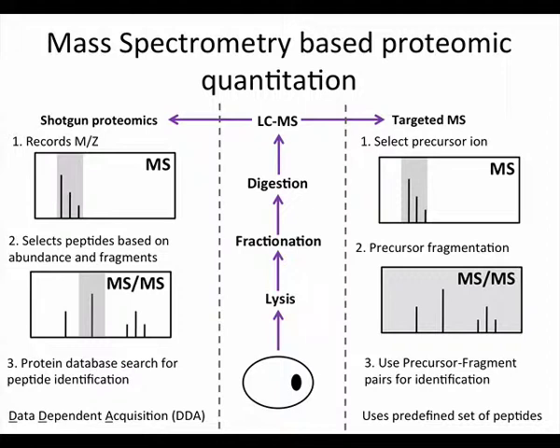But when you pre-select, like isolate those proteins of interest, what if there is a similar peptide that has the same M divided by Z? Yeah, that is a huge problem, and we're going to talk all about that. But that is exactly why you would do something like this if you have either a low expressing peptide or you really want to be specific about what you're looking for.